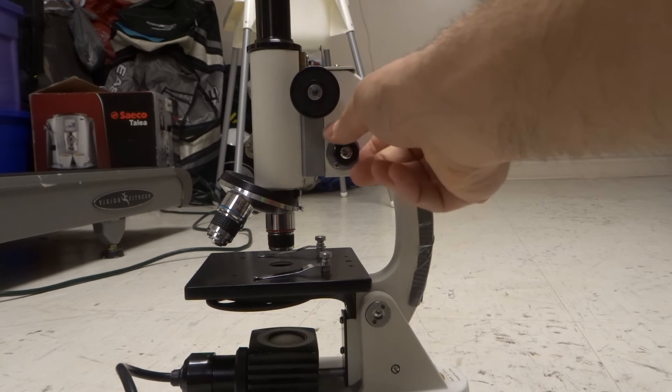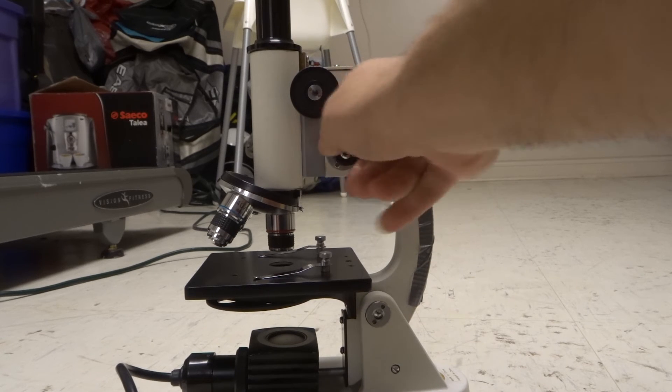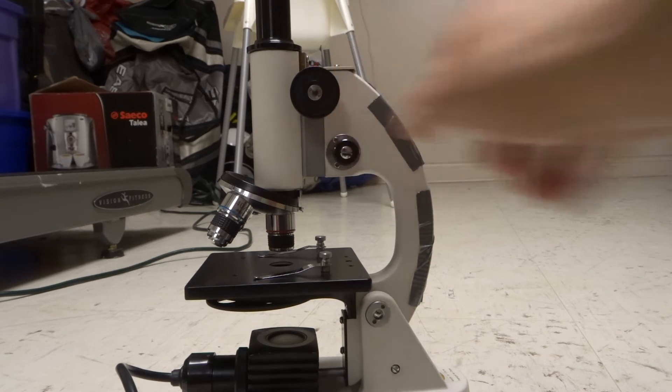Once you're at that stage, then you can go with the fine adjustment knob and you can then turn this and get even more clarity. So you want to get it even more clear.